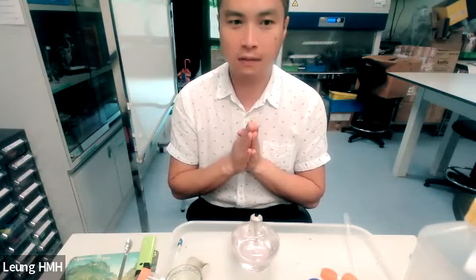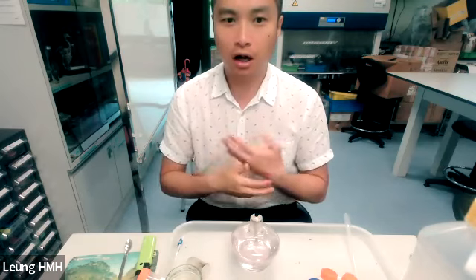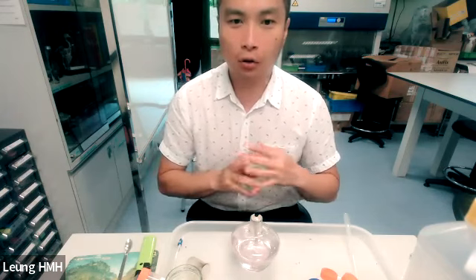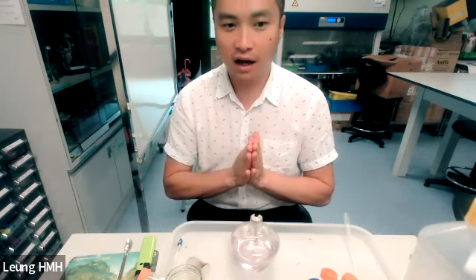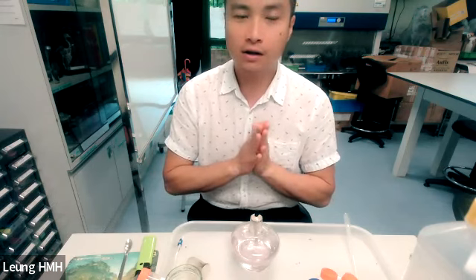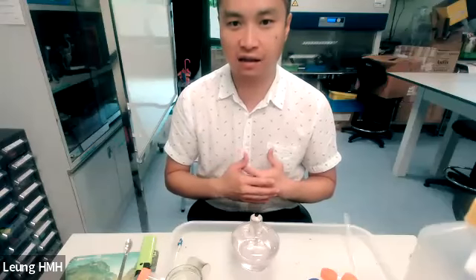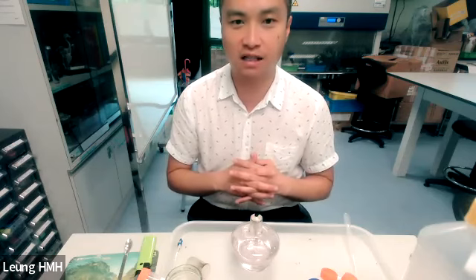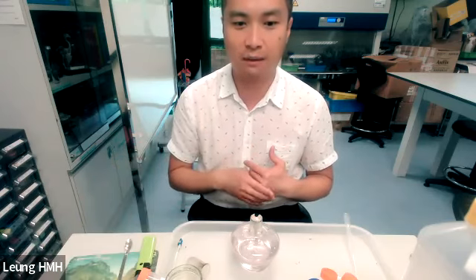After taking some lectures, I think you have some ideas on how to get familiar with the concept of biodiesel. So in this module, we try to demonstrate an experiment about how to make biodiesel by using oil. The process involves transesterification. I think you may know the word transesterification, so no doubt you have some ideas on it.